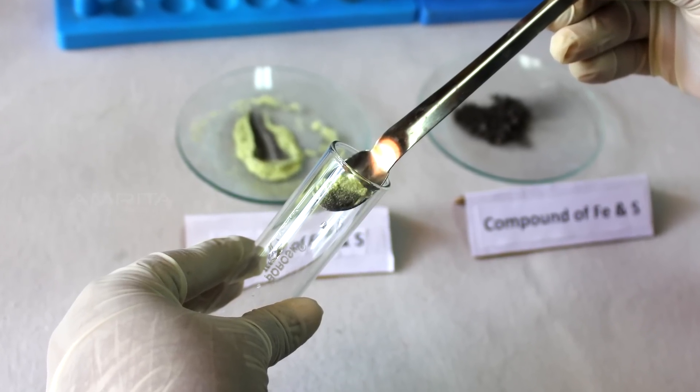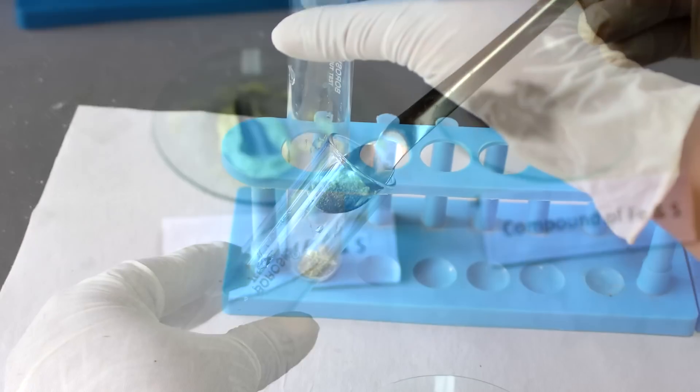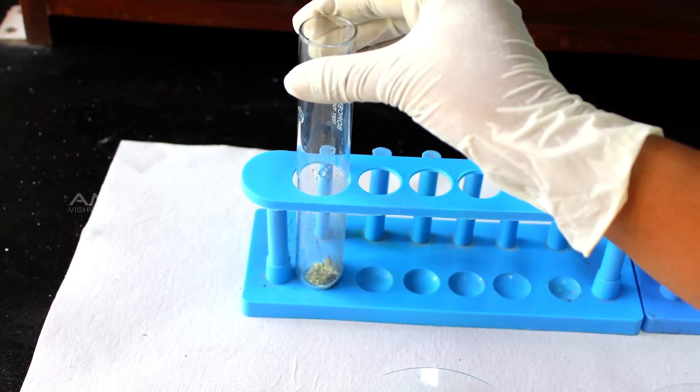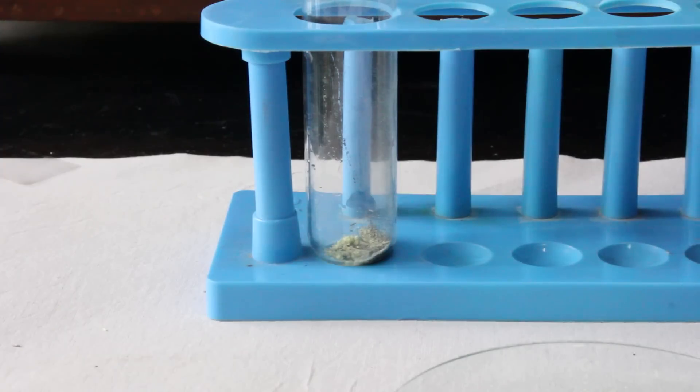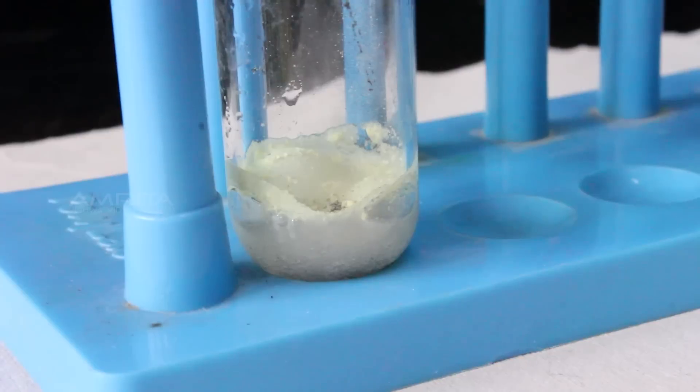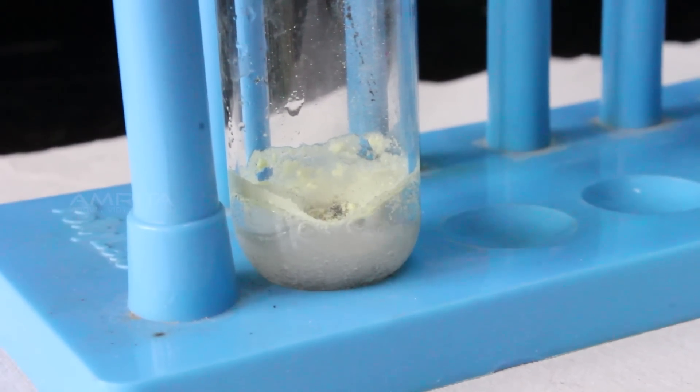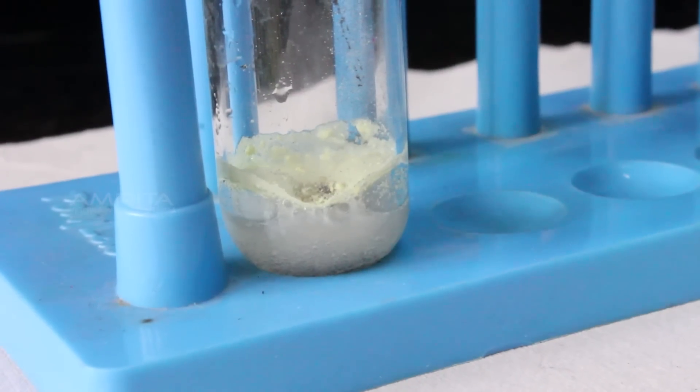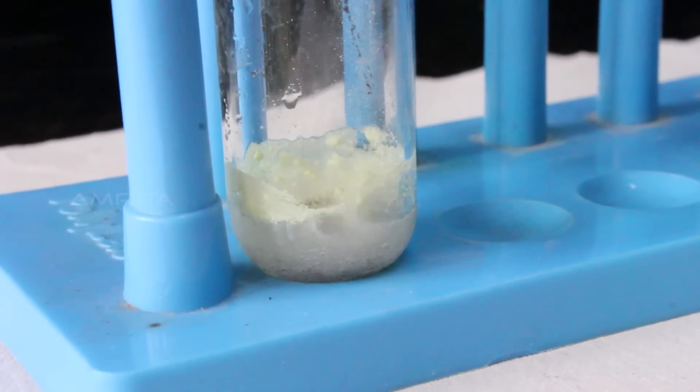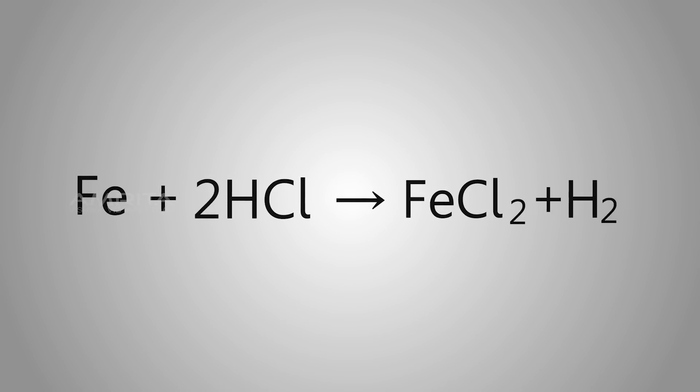Now, transfer a small quantity of the mixture to a boiling tube and place it in the test tube rack. Add a few drops of dilute HCl using a dropper. We can see the evolution of gas bubbles which indicates that iron reacts with dilute HCl and forms hydrogen gas. Fe plus 2HCl gives you FeCl2 plus H2.